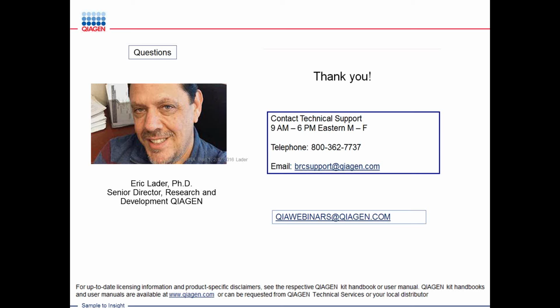For us, because of the number of people in the lab and the size of the experiments they're running, that's been the sweet spot. We tend to have to save up experiments to run on the NextSeq to coordinate enough experiments to fill it up. But if you can fill the NextSeq, it's cheaper to run because it has such a huge read budget. But the MiSeq's been very convenient.